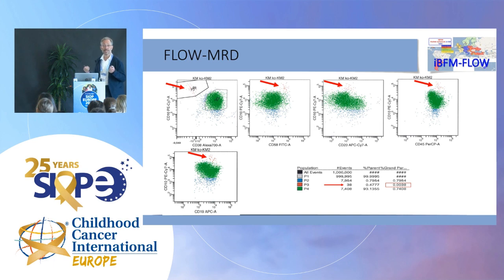It's not just an investigation, but this is a clinical grade assay. So for clinical grade, usually we go for something about 1 million cells, which in usual situations is sufficient to inform what is necessary to give a stratification.